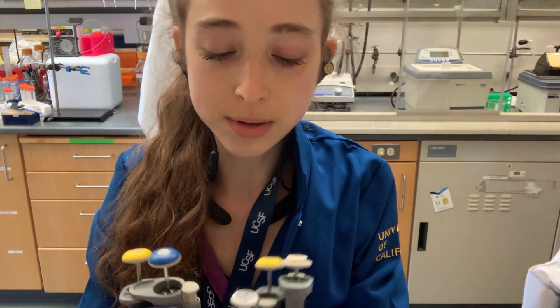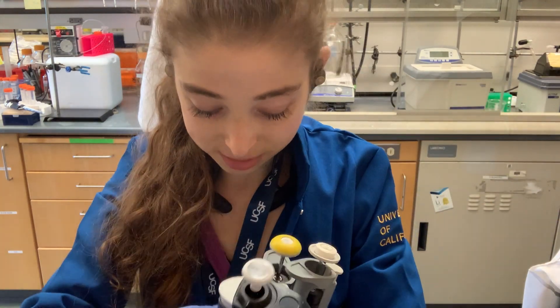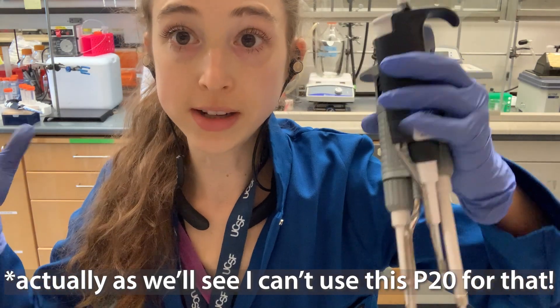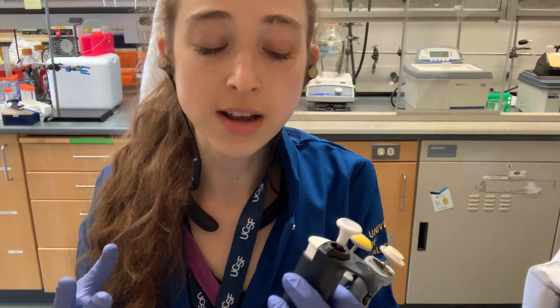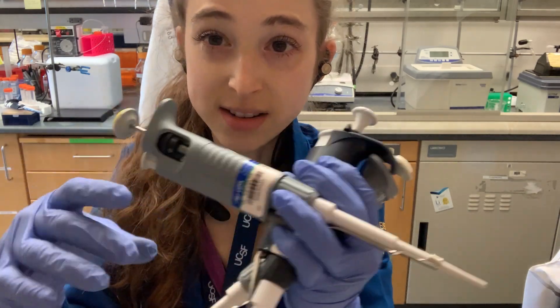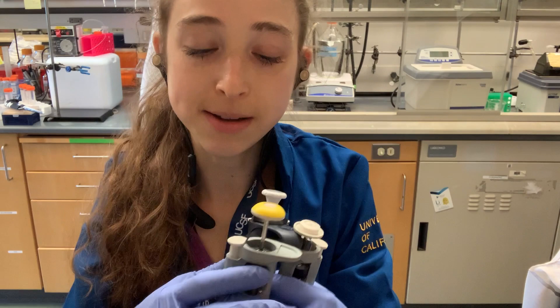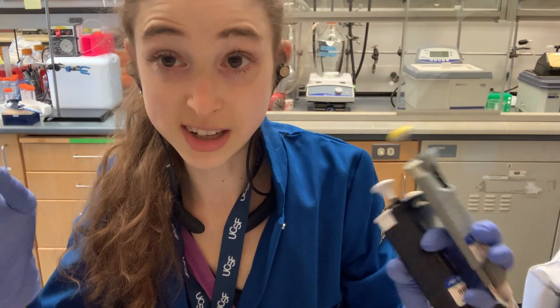So you can see there's some overlap. For example, if I have a P10, a P20, and a P2, I could use all of these to pipette, say, one microliter. But I want to choose the one that has the lowest volume, and this is going to be the most accurate. It has to do with the way pipettes are built — there's a piston-type thing inside, and there's going to be more error and less accuracy when you have a bigger pipette because it has a bigger piston.